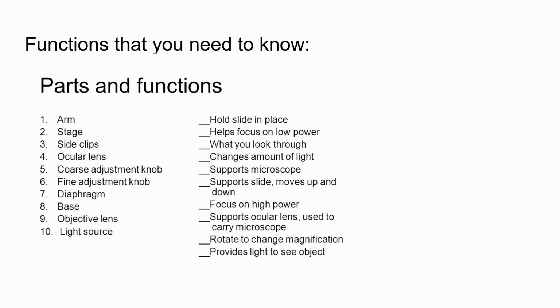So, what are the functions of the parts of the microscope? There's a matching activity here. You can pause the screen and do it, and I'll reveal the functions later.